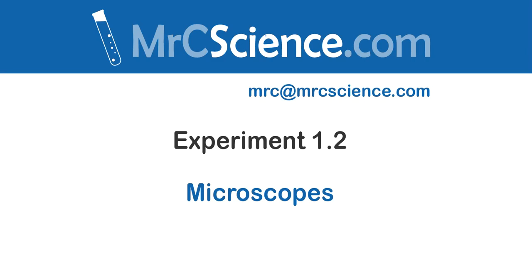Microscopes. In this course we're going to use microscopes quite a bit, especially the first semester. We won't really hit dissections until we're halfway through the book. So we need to know how to handle and use a microscope. If you're in one of my classes, it works there. If you have a microscope at home you're playing with, great. Otherwise, it's just a valuable piece of information to learn if you're going on to college and do any biological sciences.